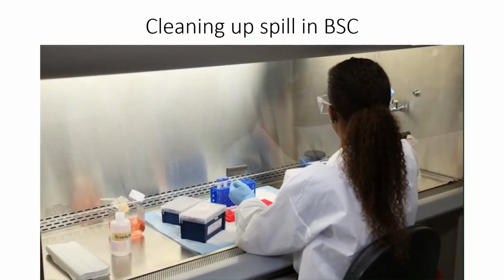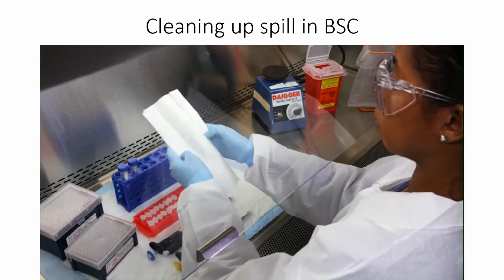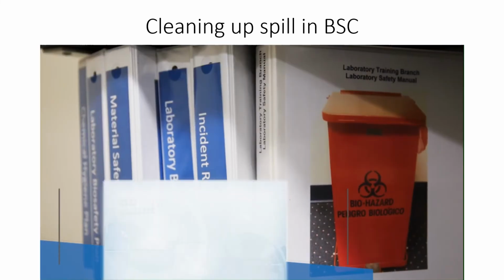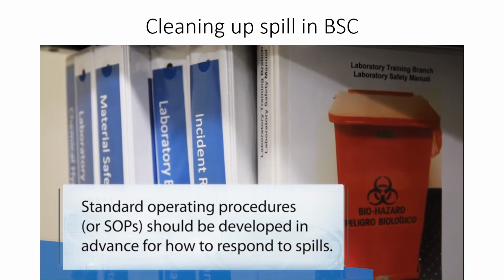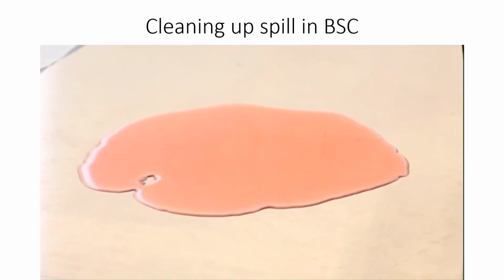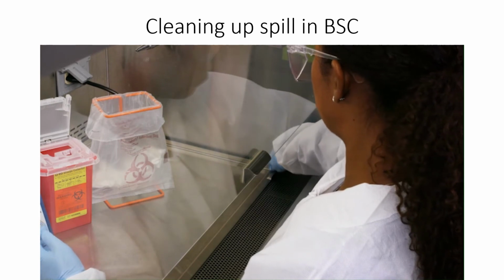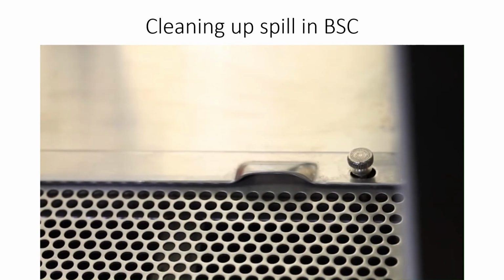If there is a spill inside the BSC, it must be cleaned and decontaminated promptly. Wearing appropriate PPE is crucial for this. Standard operating procedures, or SOPs, should be developed in advance for how to respond to spills. Cleanup of large spills, or spills that occur in parts of the BSC that are difficult to access, for example the drain spillage trough or catch basin, may require assistance from the safety office.